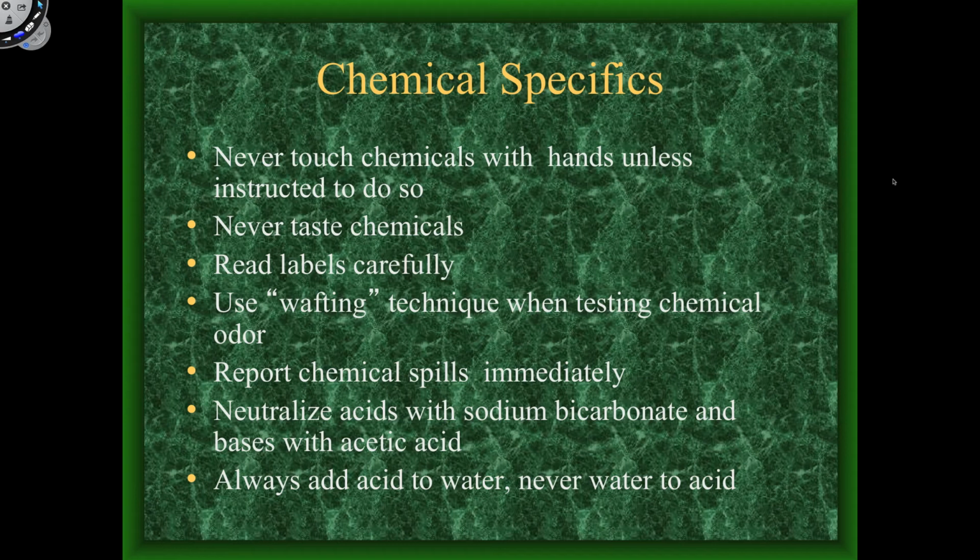If we have a base spill, we typically have vinegar, an acid, to pour on it. So if a base spills, we clean it up with an acid. If an acid spills, we clean it up with a base. Real simple concept.